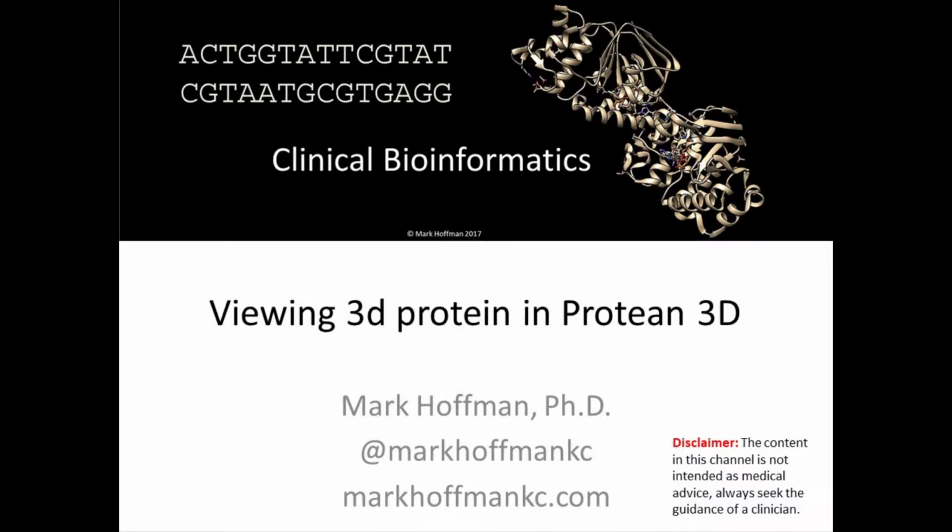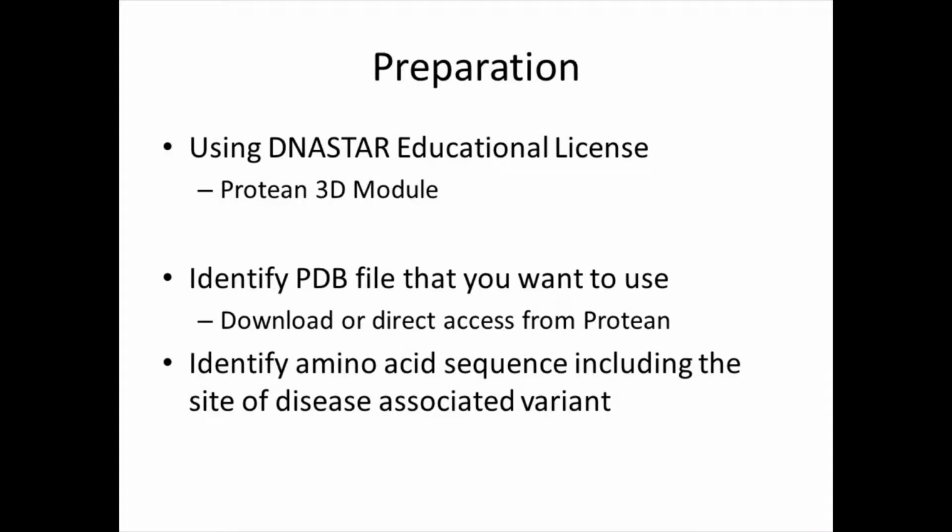In this session, we will learn how to view a three-dimensional protein structure using the Protean 3D application provided by DNASTAR. Prerequisites for this session are that you have the Protean 3D module of DNASTAR installed. We have received it through their educational license.